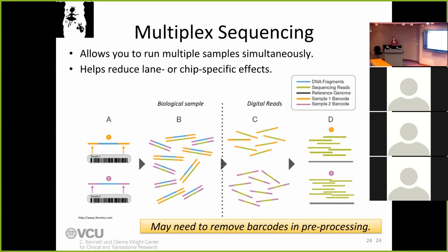Because one time I had a sample that the barcodes weren't removed. So you have to look and see if those barcodes were removed. And if not, you can remove them or have the sequencing facility remove them.